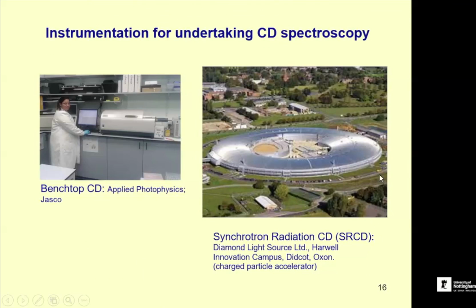As I've already mentioned, getting ahead of myself, you would go perhaps down to the synchrotron, and this was my cue to remind you of your visit to the Diamond synchrotron, so sorry about that, but that won't happen. So certainly for that wavelength range, you would need Harwell to do that, or an alternative sort of facility, such as Steve mentioned down in Grenoble. I'm sure there are plenty of other places as well, Japan and all sorts around the world, but this is our UK version of that.